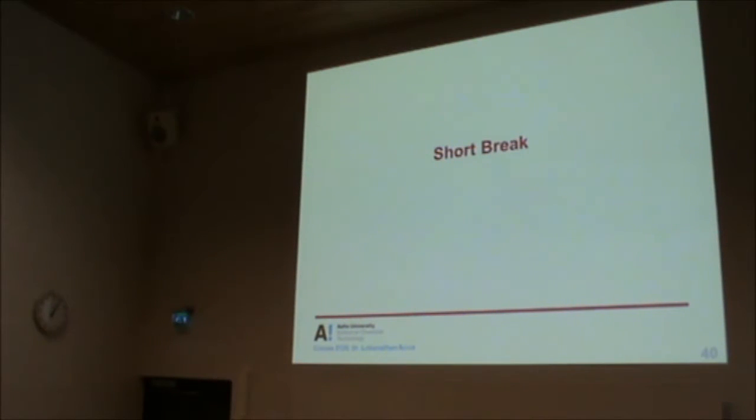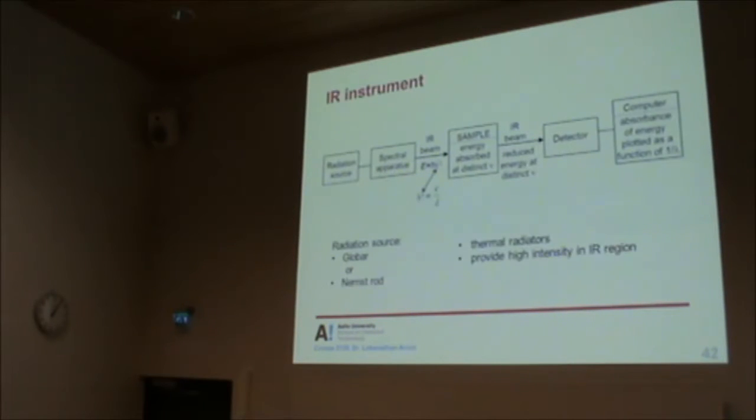Okay, let's continue from where we left. Now, we've seen some examples of spectra, how to interpret spectra, how to use infrared spectroscopy. Now I will talk about how the instrument works, how we record a spectrum.